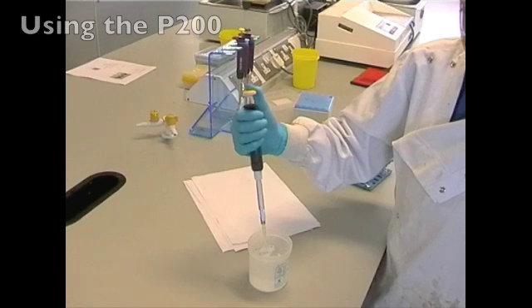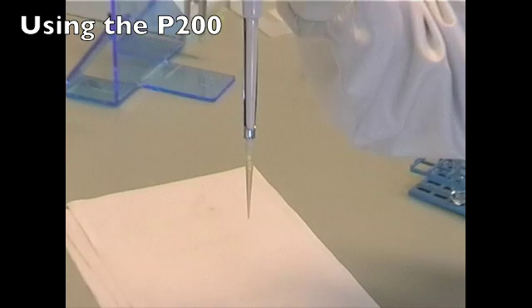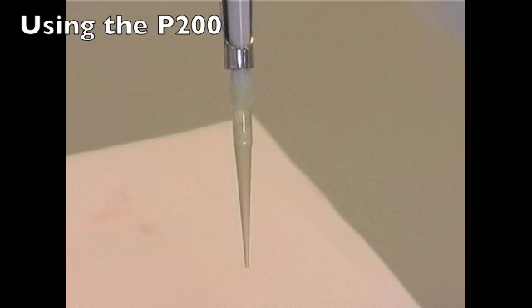If the P1000 you are using has a tip less than one-fifth full, you should be using the P200. Remember the range of the three pipettes and you should have no trouble choosing the correct pipette.